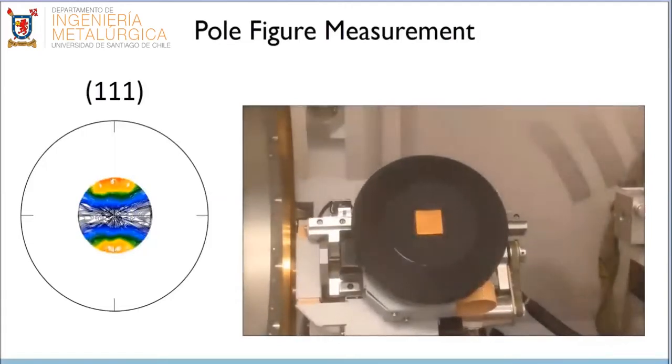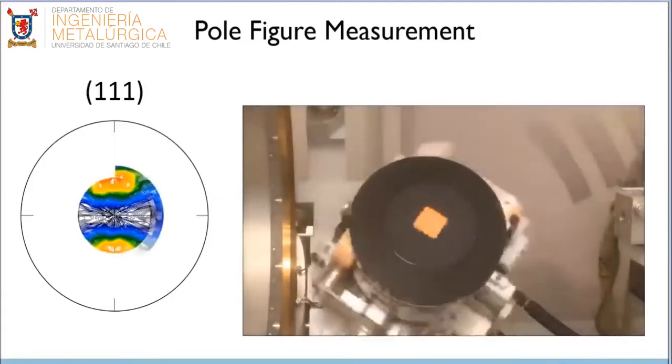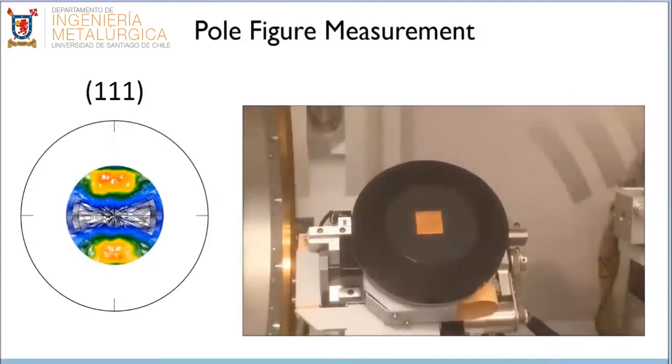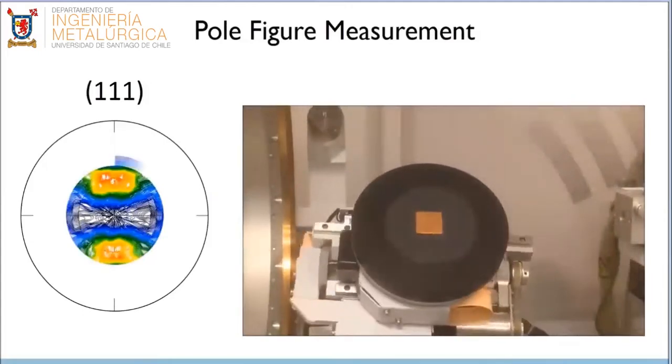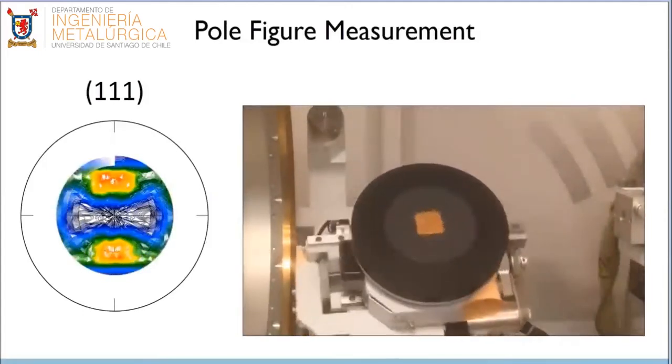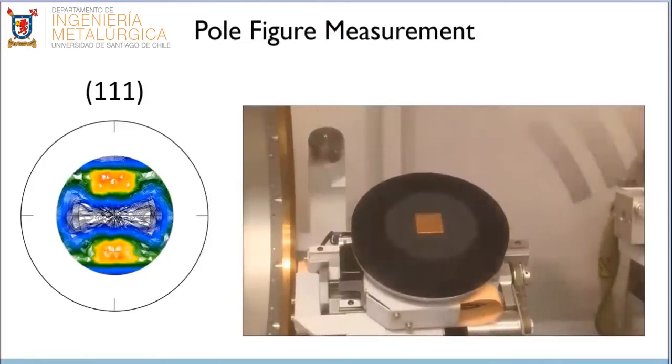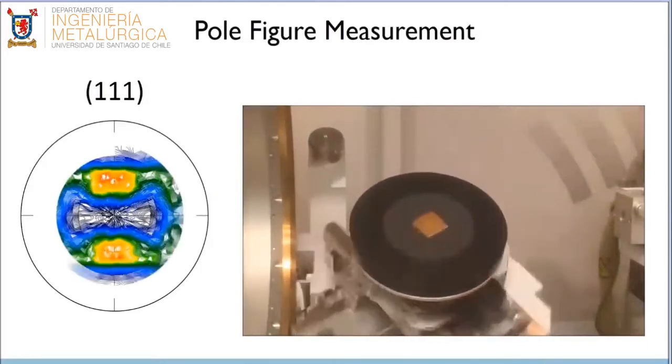We continue this until chi reaches approximately 70 to 80 degrees, because it is at this point that the X-ray beam typically begins to fall off of the sample. Because this type of experiment deals strictly with the intensity of the peak, the entire X-ray beam must remain on the sample throughout the experiment.